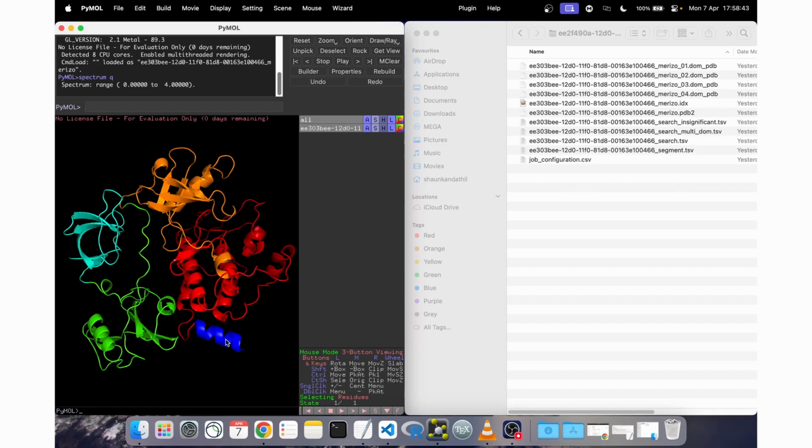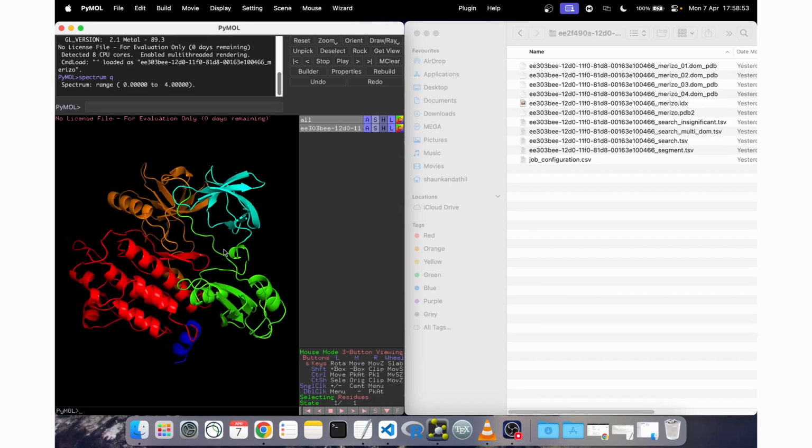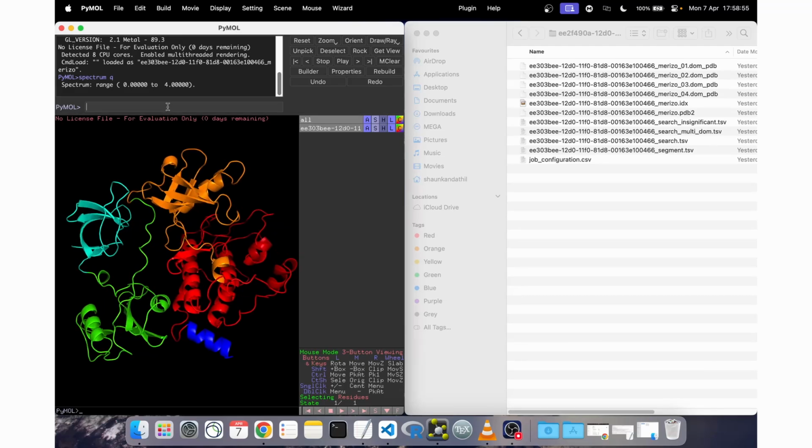And the dark blue section here corresponds to the non-domain residues of this particular structure. This shade of dark blue is used by default for the non-domain regions, but you can easily change that by saying color gray, let's say, and then just say q less than 1. So all the NDR residues are assigned an occupancy value of 0.